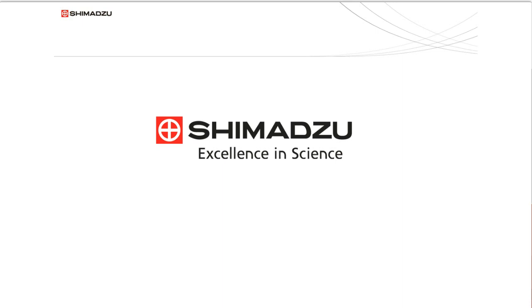IG, if I remember correctly, was a really big win for them. Many compounds that couldn't find any resolution on anything else resolved quite nicely on IG. I believe they now have IH and IK commercially available. I don't have a lot of information on those, but I do know IG is quite a good one.